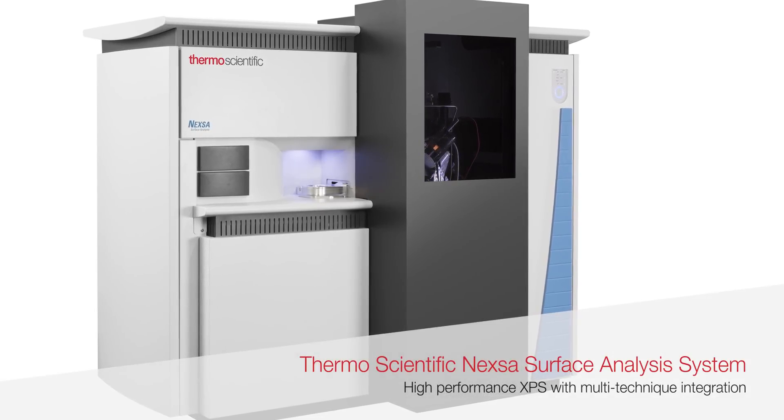The ThermoScientific NEXA surface analysis system is our latest XPS instrument with multi-technique analysis and high throughput in mind.